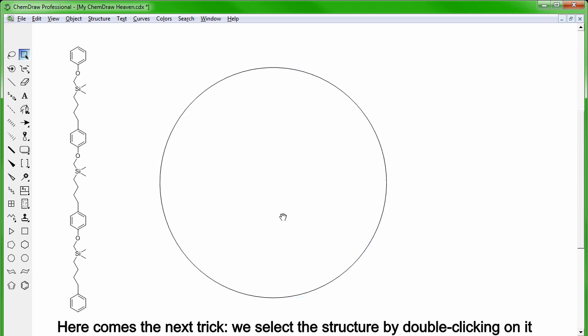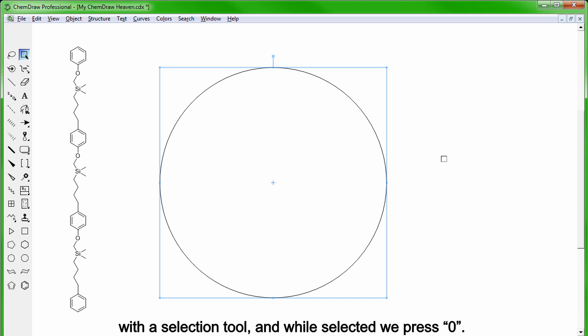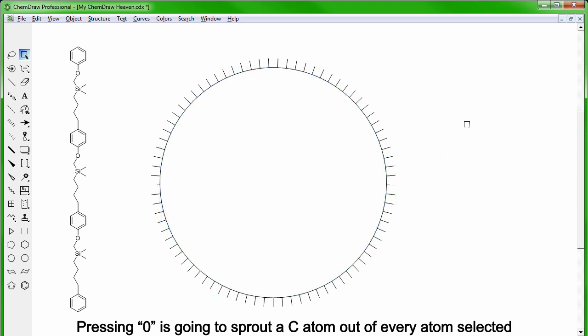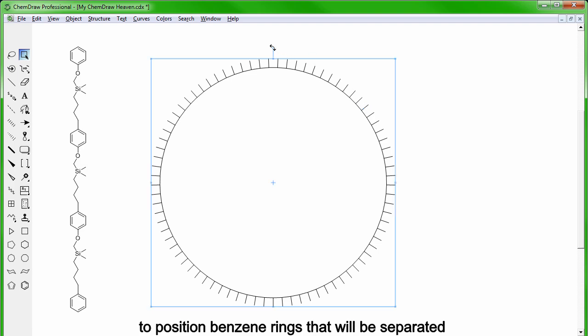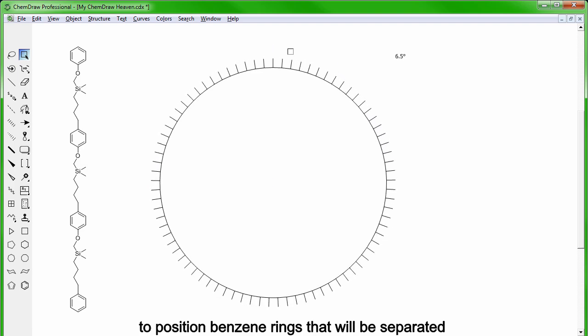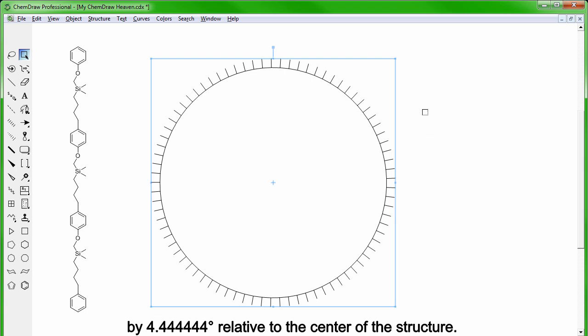Here comes the next trick. We select the structure by double-clicking on it, and while selected, we press 0. Pressing 0 is going to sprout a carbon atom out of every other atom selected, in our case 81 carbon atoms. So there you have it, a neat circular structure on which we are going to position benzene rings that will be separated by 4.444444 degrees relative to the center of the structure.